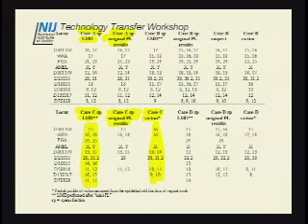But we look at case D. The original preferential lysis results were a pretty good profile, some dropout, some loci didn't show up. Unfortunately, in this one, when we did it, we only got a partial profile. So in that particular case, we actually got worse results. So far, we have 1 case with similar results, 1 case with improved results, and 1 case that we actually didn't get as good of a result as the original.